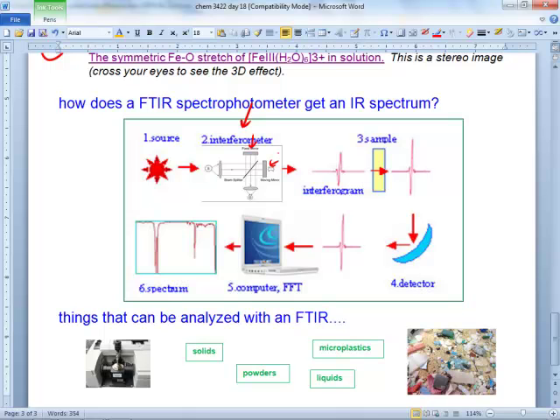Okay, but so you get a plot before you get the sample? So what they're doing is they're getting this interferogram going, and you're right. This light is striking the sample, and some frequencies are being attenuated in it, and it figures out what those frequencies are. So all that information is in one little interferogram, but it's going from the distance in the mirror, or the intensity of the interferogram, to the frequency region. So it's doing this Fourier transform to go from one domain to another, but it works, and I can't really go much further than saying that. I mean, if you build one, it makes more sense.